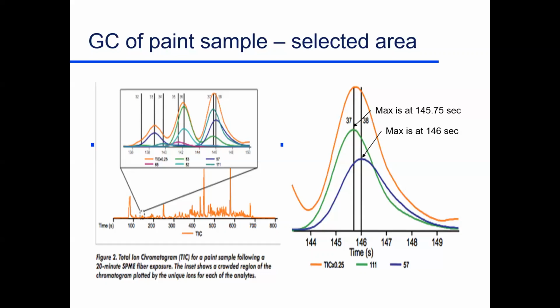But there's another set that, poof, a little bit later they're there. And so this only differs, the top of this peak to the top of this peak differs by 0.25 seconds. And the machine says, hey, the set of ions is moving differently than these. And so the machine looks at these ions separately, and these ions. So there's no separation of that peak.